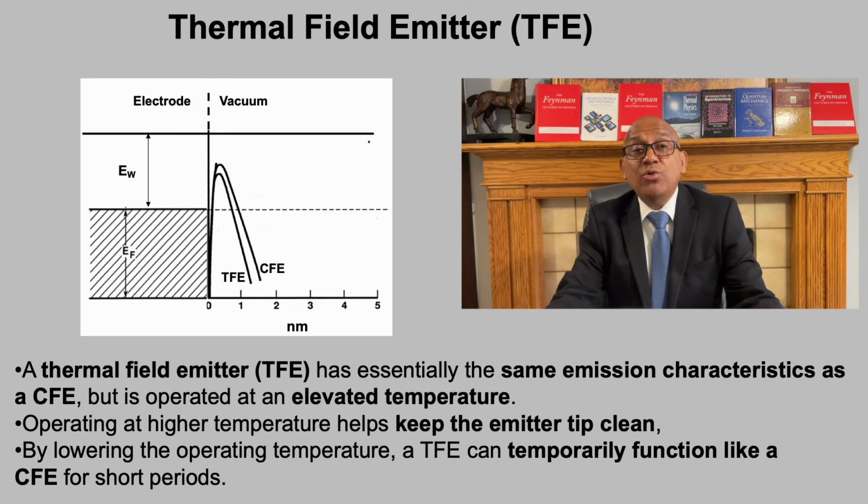The primary role of this additional heating is not to drive thermionic emission, but to keep the emitter tip clean by reducing the buildup of adsorbed gas molecules. As a result, TFEs exhibit lower noise and improved emission stability, even when the vacuum quality is not as extreme as that required for CFE operation.